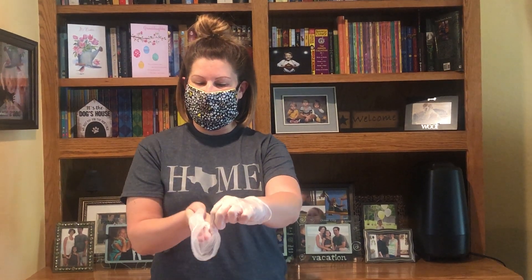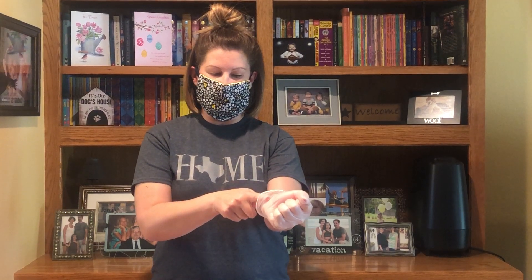To take them off, you need to know that the outside of your gloves are what's contaminated and the front of your mask is what's contaminated. So you are going to take your gloves off first. Pinch one of your gloves on the outside, roll it down inside out, crumble it into your glove hand. Put one finger underneath the rim of your other glove, pull down, turn it inside out, and throw it away.